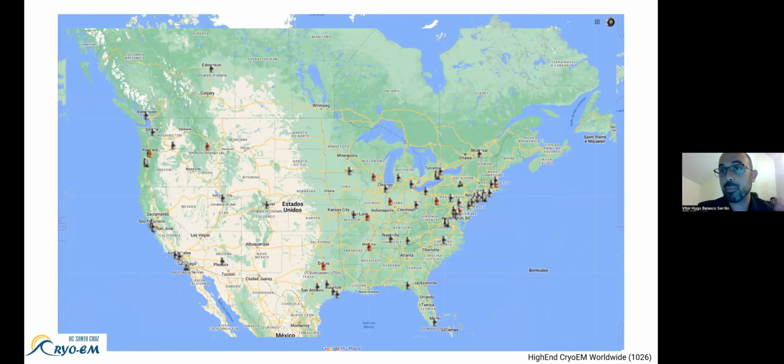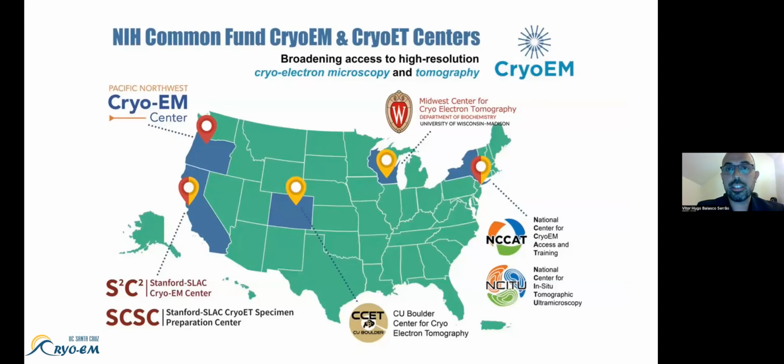But the majority of them belong to institutes that are either companies or home institutes, such as a university. And then they should provide service, sometimes you pay for service, sometimes it's hard to get access unless you start doing collaborations, etc. But NIH started quite a few years ago, and as you just heard about the national centers, these national facilities provide free access for samples ready to go in order to get high resolution data sets.